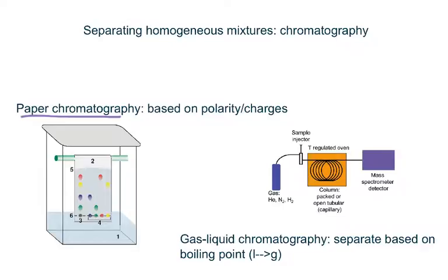More detail about polarity will be discussed later on, but what we have in this image is basically a piece of chromatography paper, which is shown right there. And we have maybe a drop of the liquid mixture at the bottom, so in this case, the liquid mixture might be the dot labeled 3. What happens is that we dip this paper along with that dot, which is the liquid mixture that the paper absorbed, into a liquid solvent like water, which is that stuff over there.